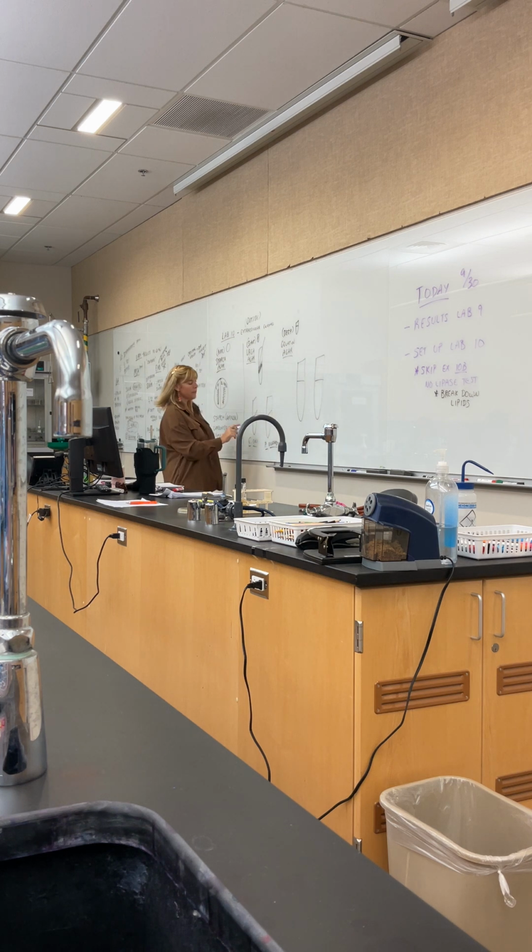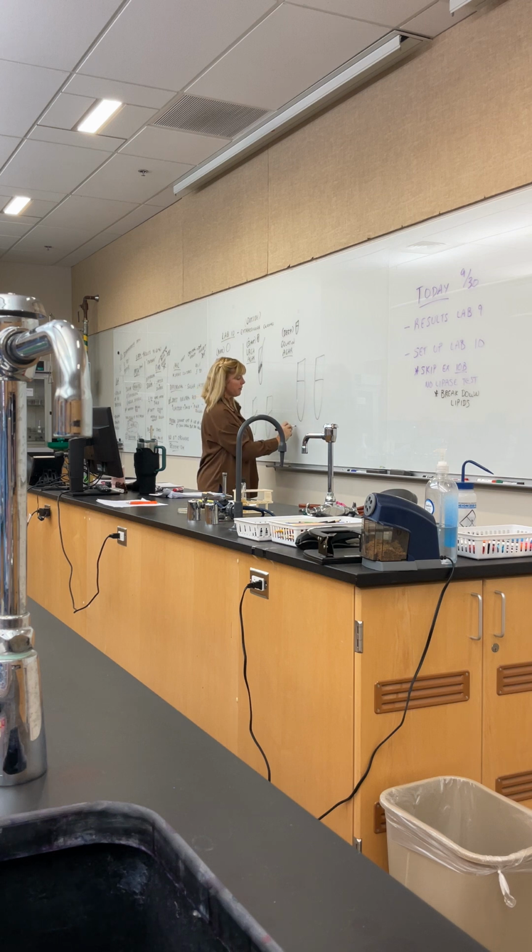All right, so one of you does E. coli, one of you does Proteus. You guys can figure out how you want to do that. The gelatin agar, the same idea. One of you is going to set up Staph aureus, the other one is going to set up Staph epidermidis.